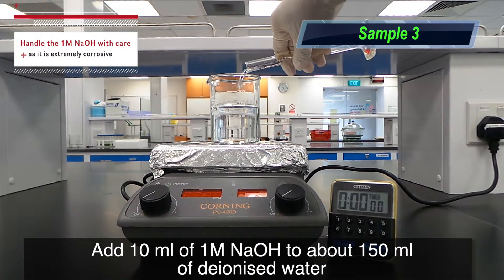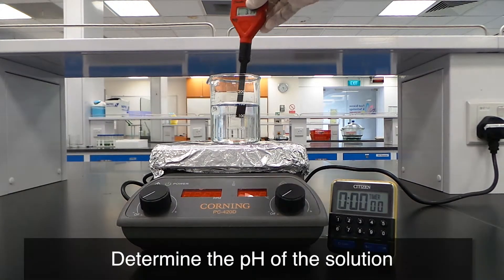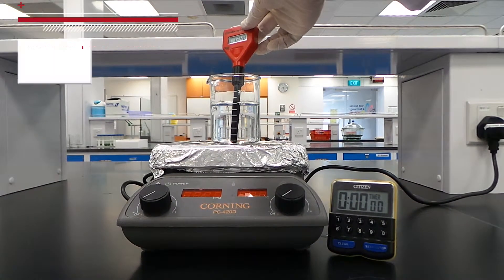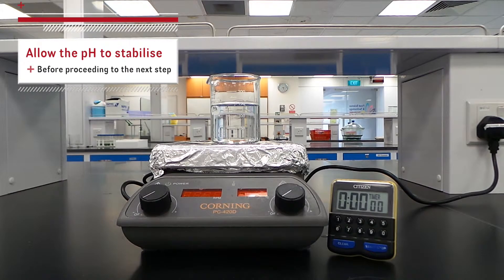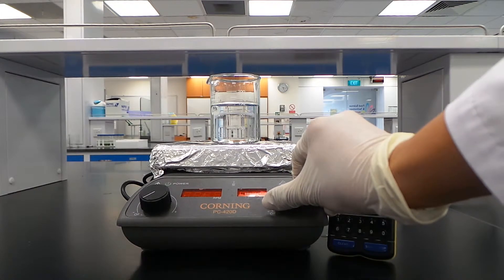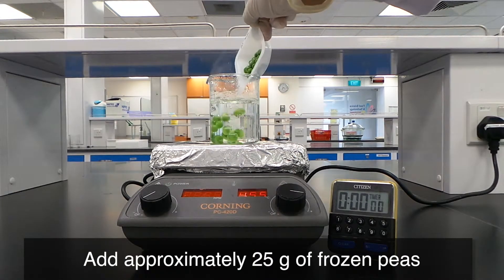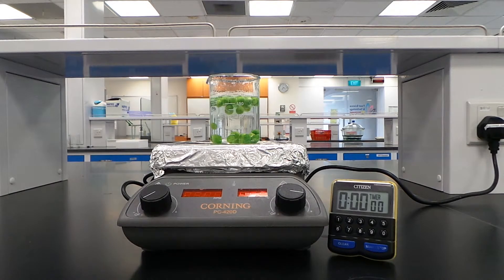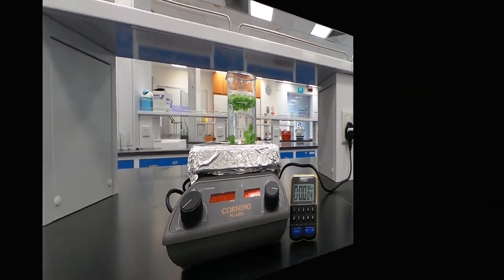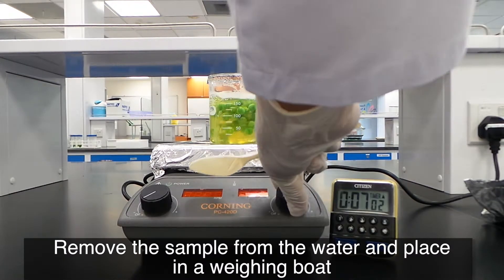Add 10 ml of 1 mol/L of NaOH to about 150 ml of de-ionized water. Determine the pH of the solution and allow the pH to stabilize before proceeding to the next step. Heat the solution to boiling. Add approximately 25g of frozen peas, bring to a boil, and continue heating for 7 minutes. Remove the sample from the water and place in a weighing boat.